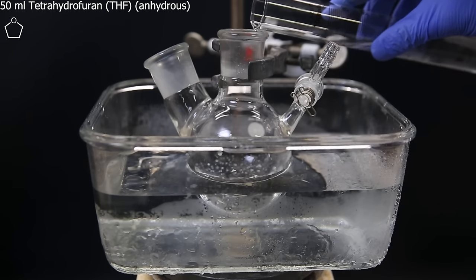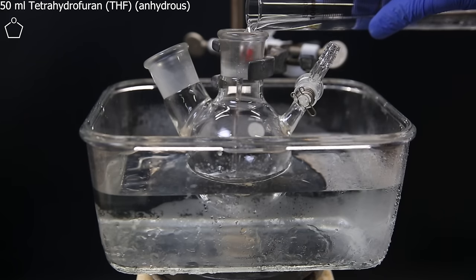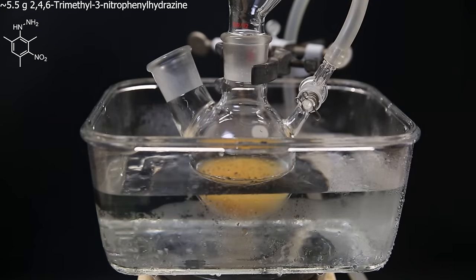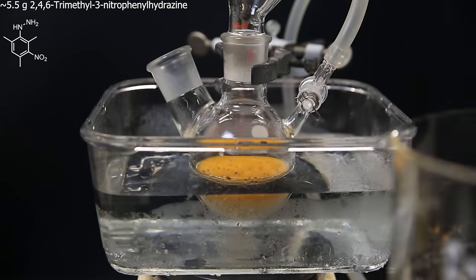Now for the next step, I set up a flask in an ice bath and add in 50 mL of THF that I dried with molecular sieves. Under a stream of nitrogen, I add in all of the free hydrazine that I made before.